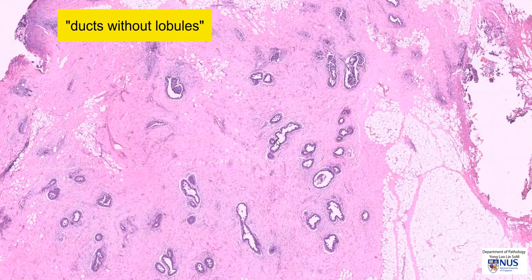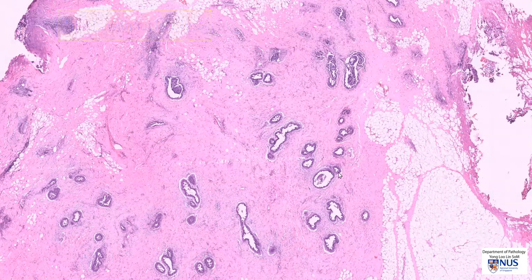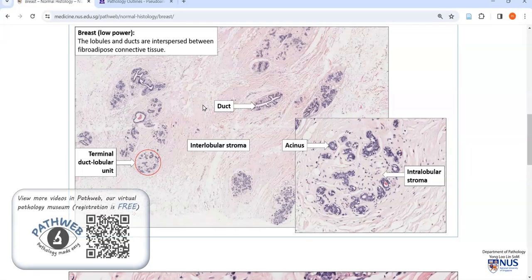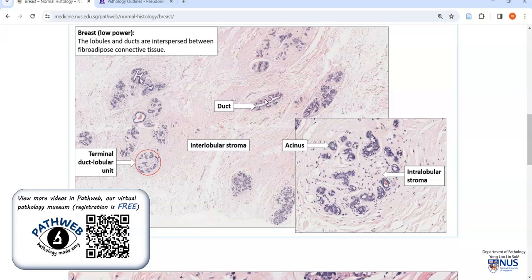In the female breast, there are usually larger ducts and terminal ducts which are surrounded by lobules. Looking at a page from our online pathology resource PathWeb in the normal histology section, we can see that the female breast shows ducts and lobules. A magnified picture of a lobule shows these round acini and intralobular stroma — so we usually have both lobules and ducts.